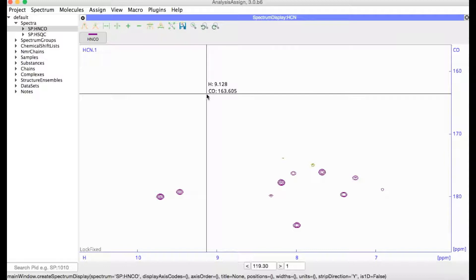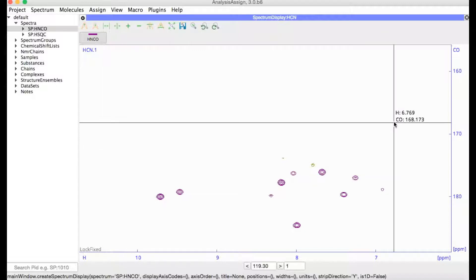I get a spectrum display showing my 3D spectrum with protons on the x-axis, carbon on the y-axis, and nitrogen along the z-axis.